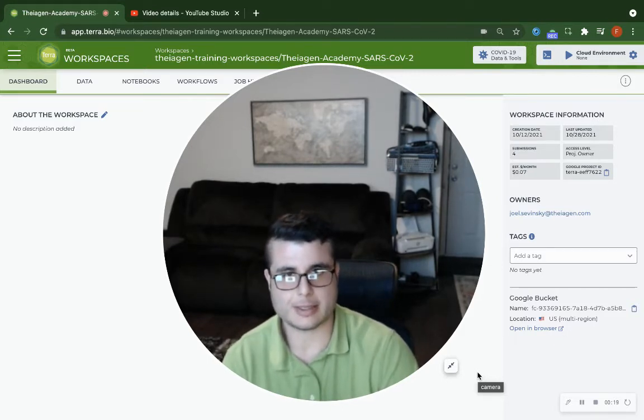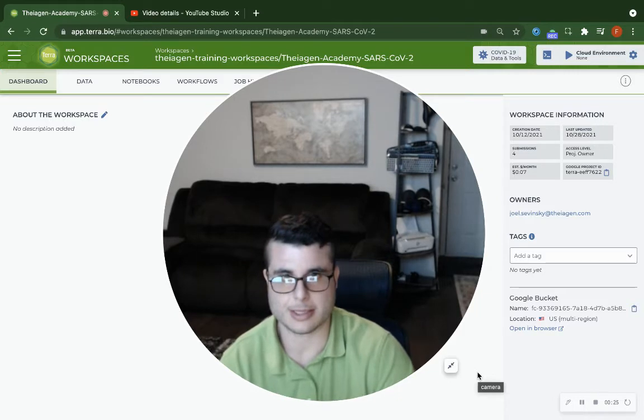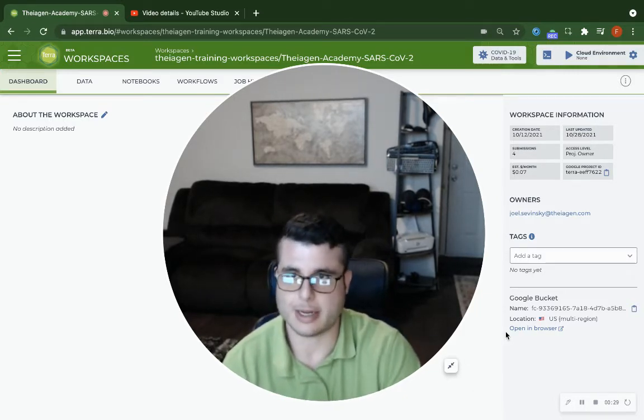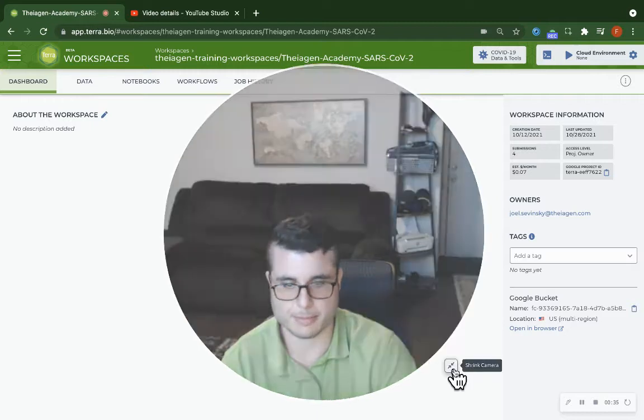If you have not yet set up Terra integration with your Clear Labs portal, please reach out to us at support@terrapublichealth.zendesk.com, and we will assist you in setting up this integration. Now that we've confirmed we have some data to use, let's navigate to the Workflows tab and get started.